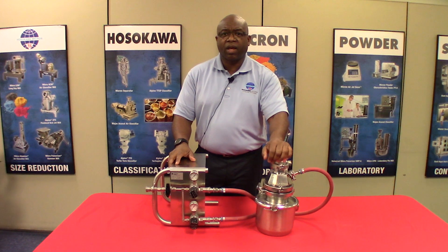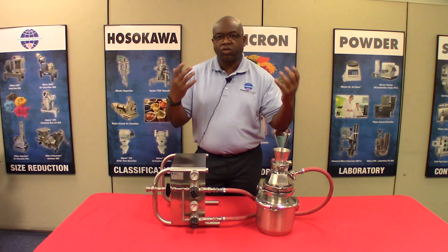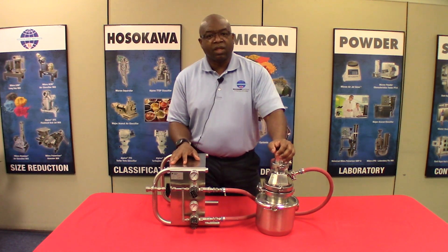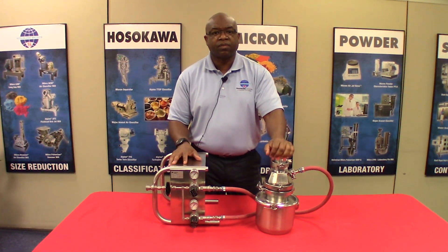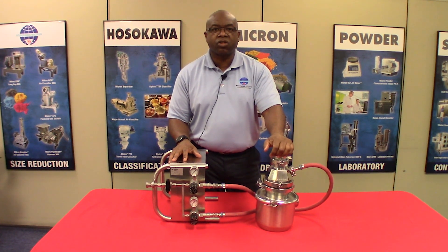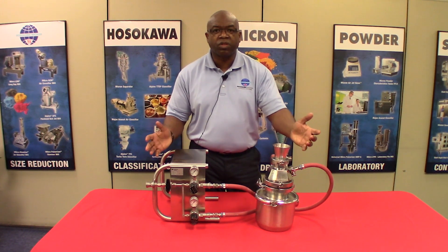Before we begin, as with any equipment, make sure that you wear your safety glasses. The spiral jet mill is a tabletop laboratory mill. It's capable of achieving particle size distributions of a D97 less than 5 microns with most materials.